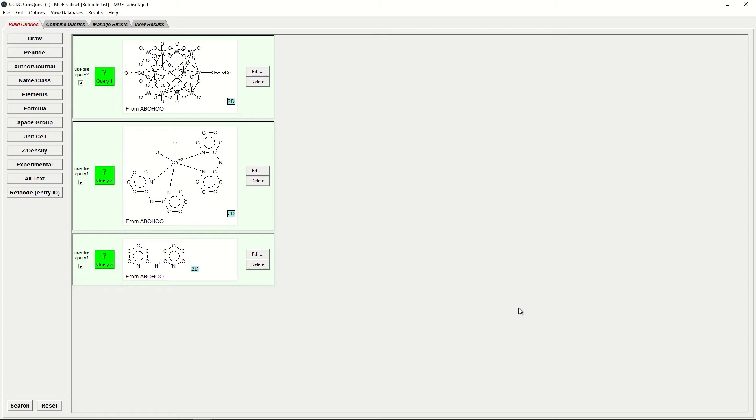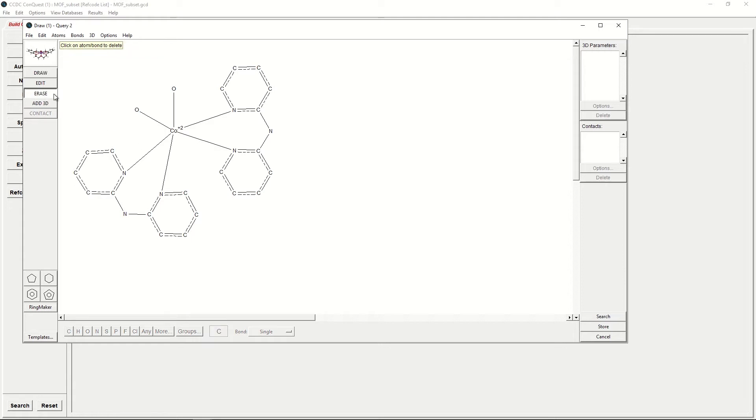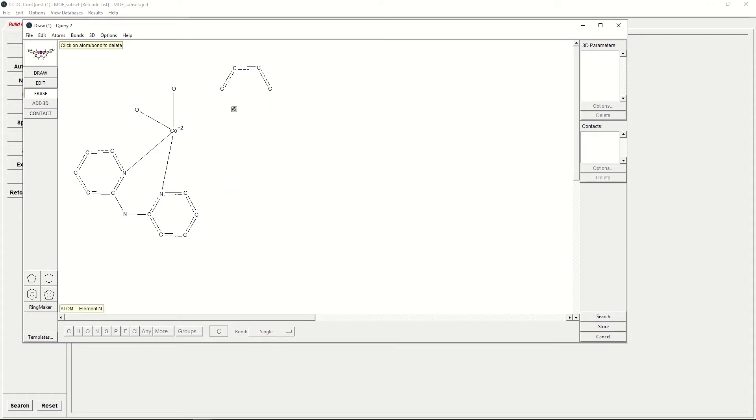The one we're interested in is this for the Cobalt Centre, so we're going to tick Edit. Initially, we would only like one of these dipyridyl ammonium ligands to be included in our search, so we will erase the other one. Erase it by clicking Erase and ticking each of the atoms in turn to erase the ligand.